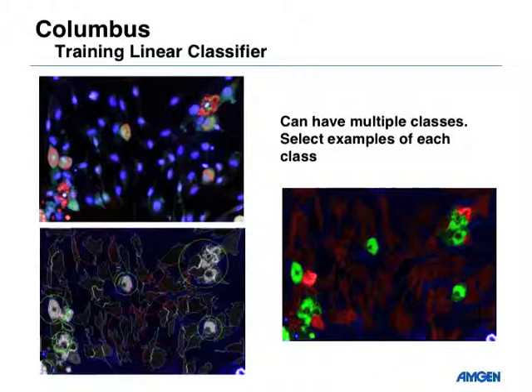I'll look at the population, and the things that are green I've selected as part of this population, and the things that are red are that population. One of the things with this is that you only get a couple of different populations. It works pretty well up to about 3 populations.